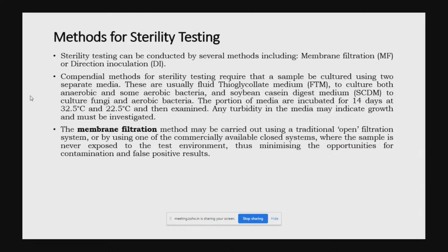So how do we perform the sterility test? In sterility, we use the same membrane filtration technique. In sterility, two types of methods are available. One is the conventional method. What is the conventional method? It's a kind of open method. In that, what we do, we take the filtration assembly, we keep the membrane filter, transfer the products, filter out the products, wash it, and after completion of that cycle, we pull out that membrane, and we cut the membrane into two equal portions.